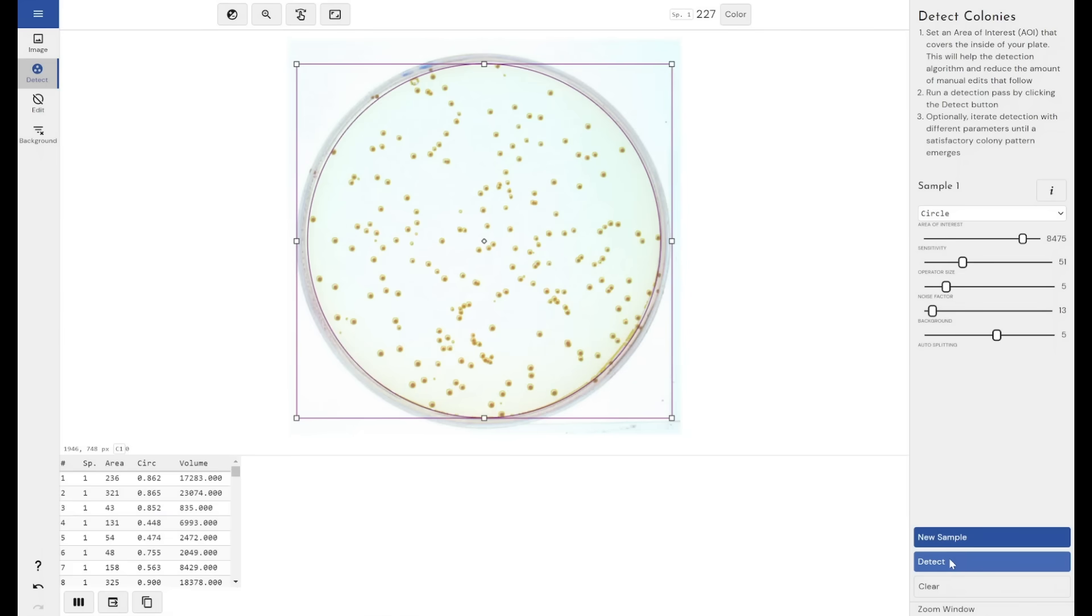If I click detect here, you can see that we've now got circles marking the boundaries of the colonies that have been detected by the software. We start to get measurements from our colonies.